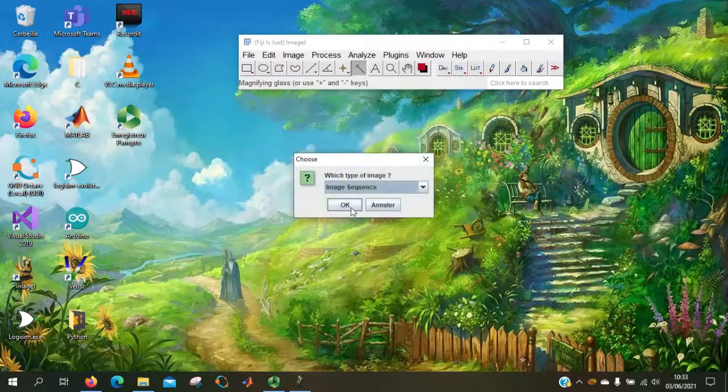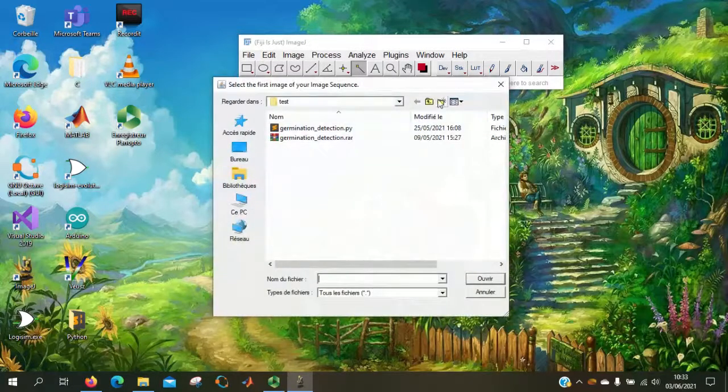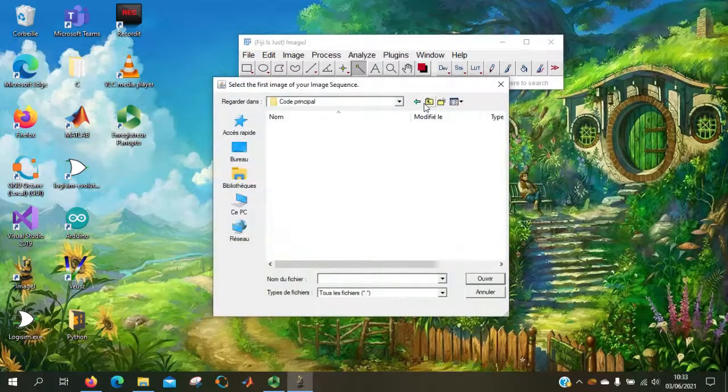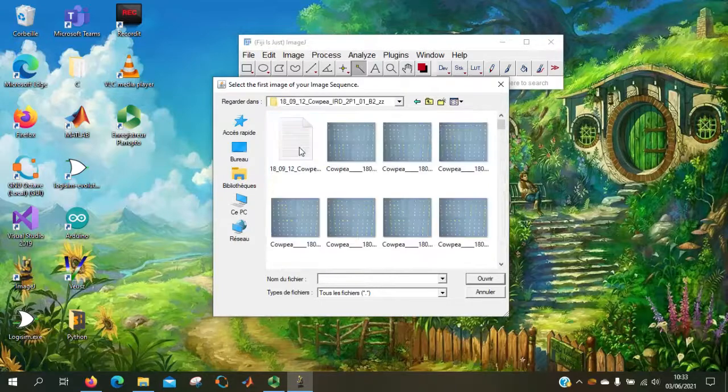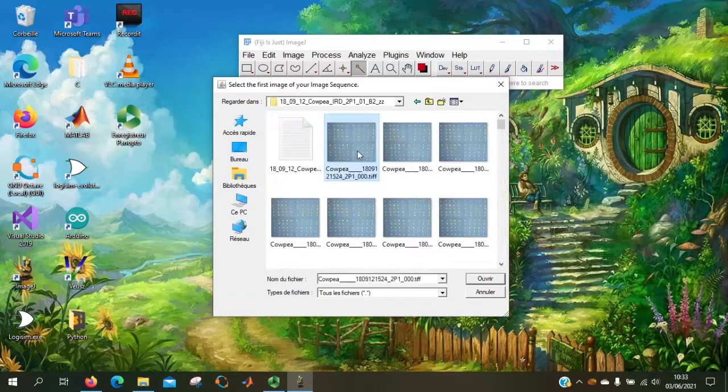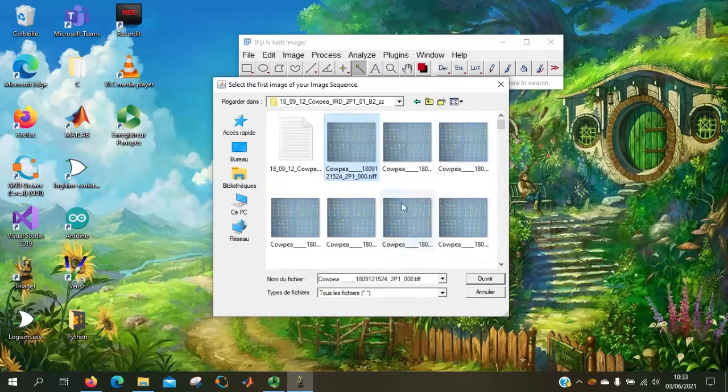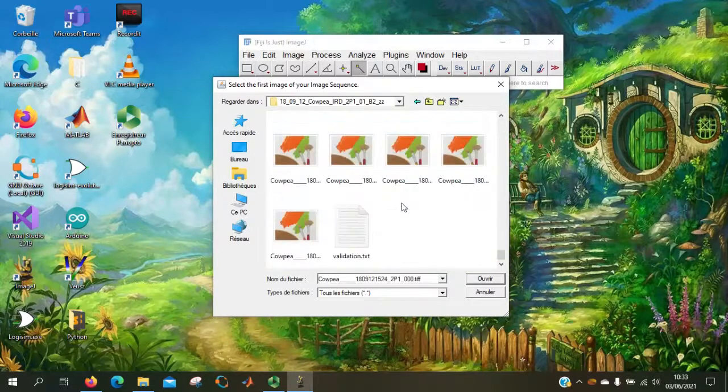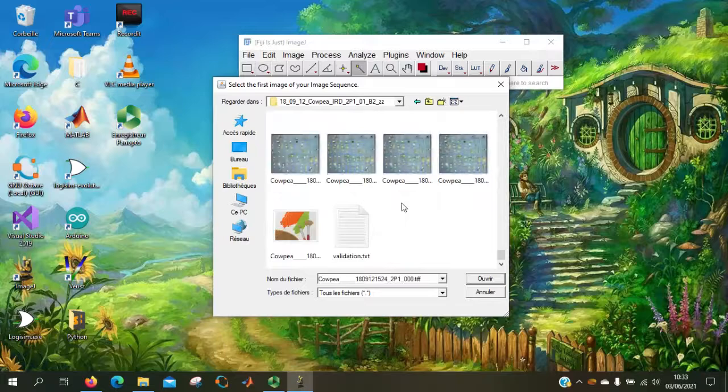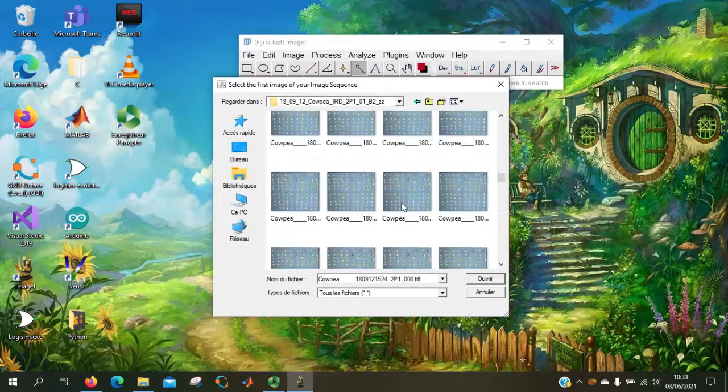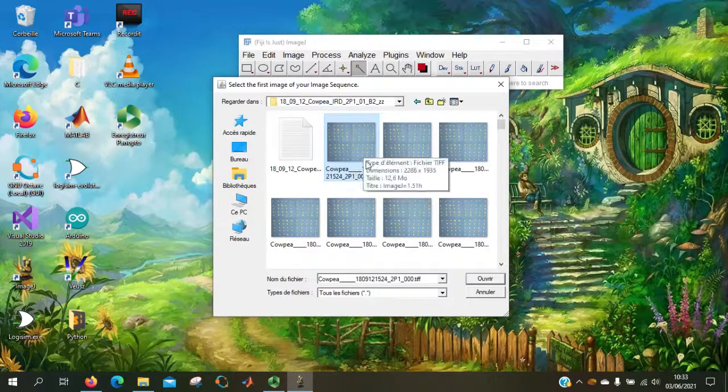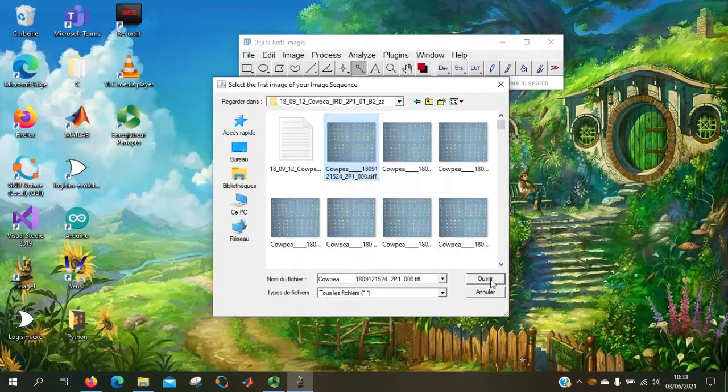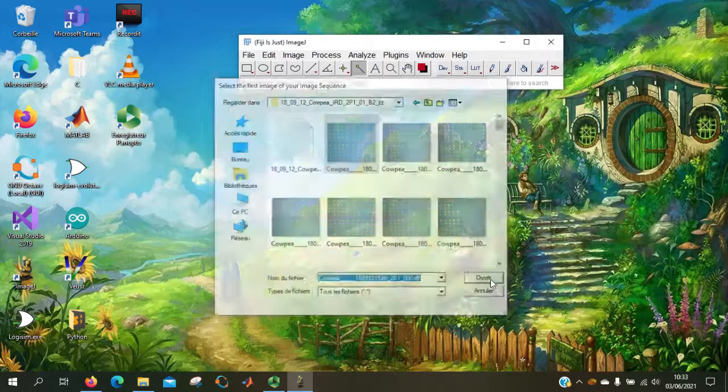Okay, so it is an image sequence. Here we got all the images. So we select the first.